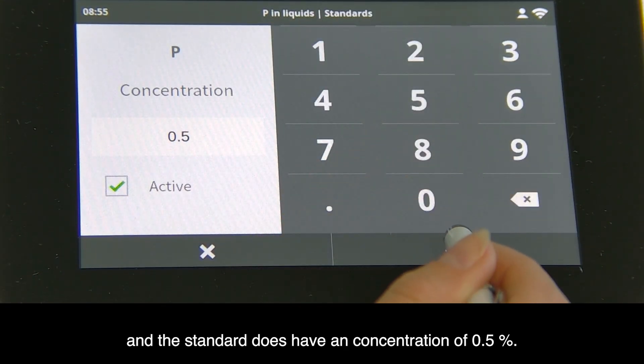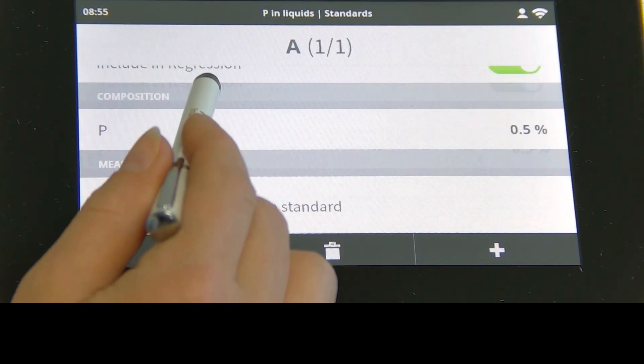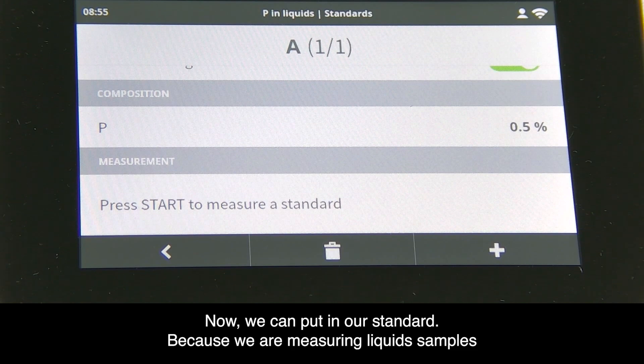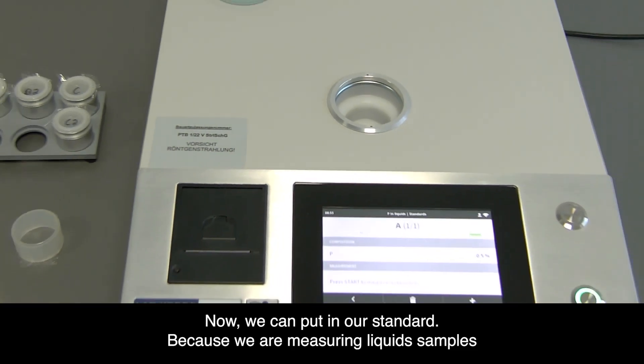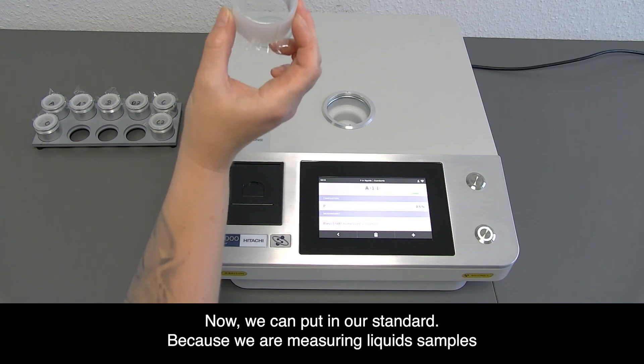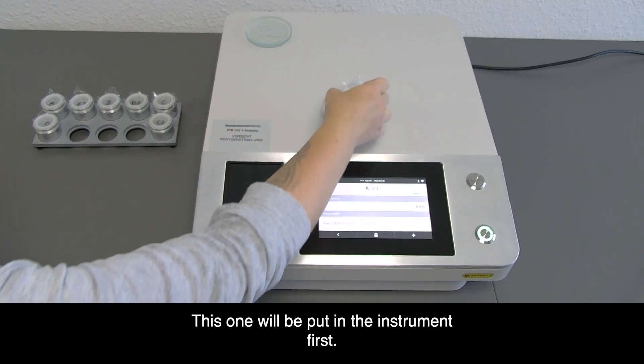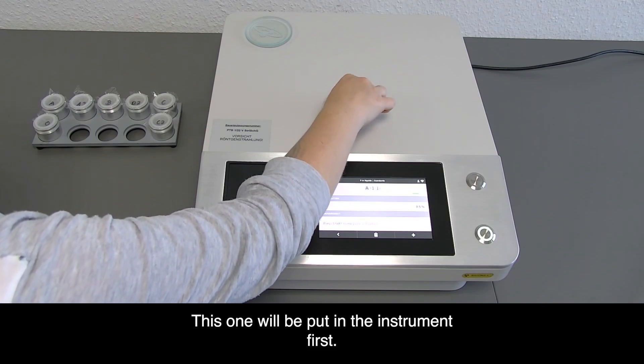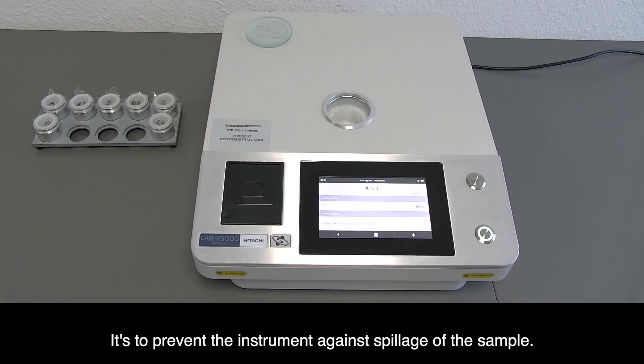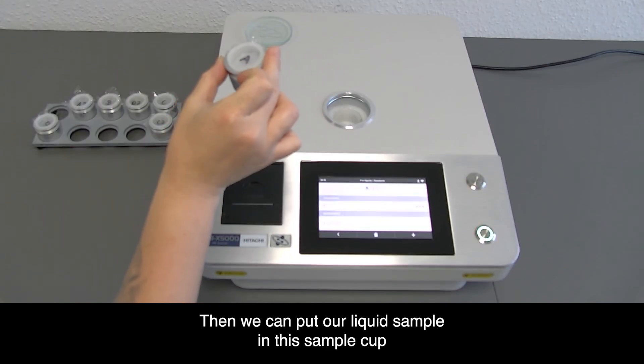We can put in our standard. Since we're measuring liquid samples, we use a secondary safety film. This is put in the instrument first to prevent spillage of the sample. Then we put our liquid sample in the sample cup.